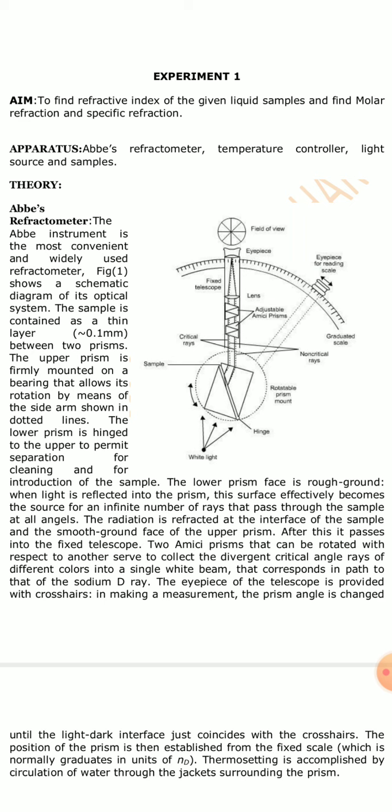In experiment number one, the aim of the practical is to find the refractive index of the given liquid sample and to find the molar refraction and specific refraction. The apparatus for this experiment: Abbe refractometer, temperature controller, light source, and sample.